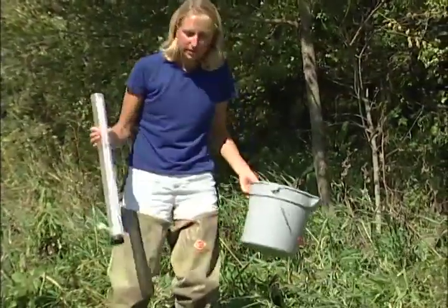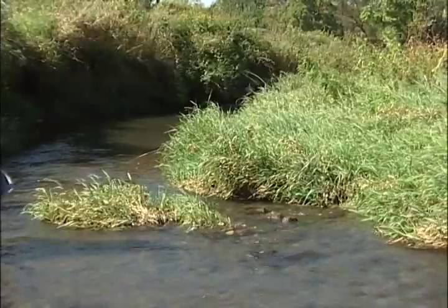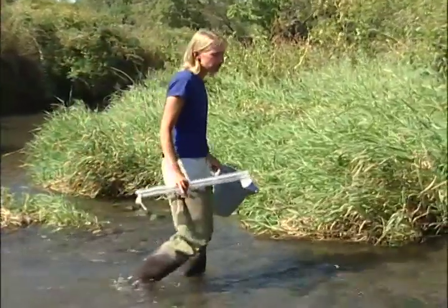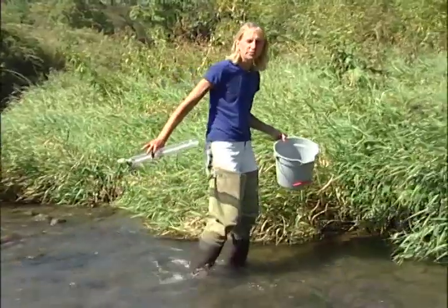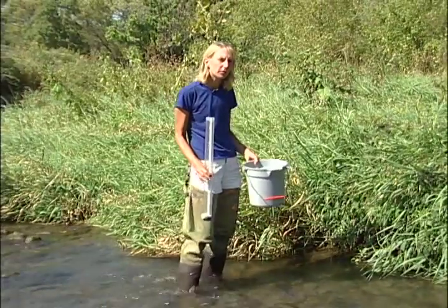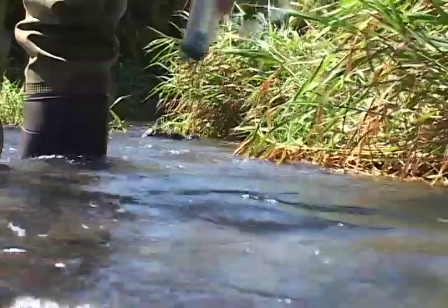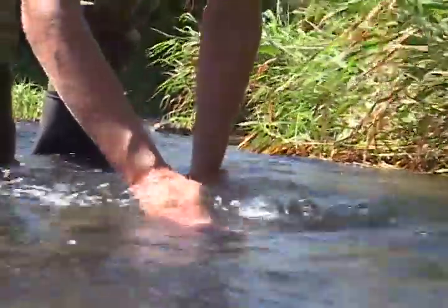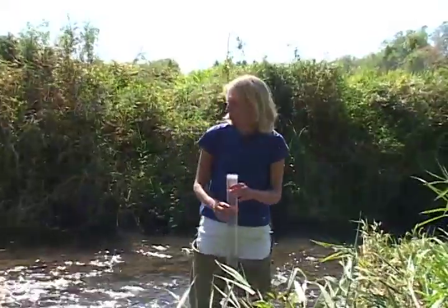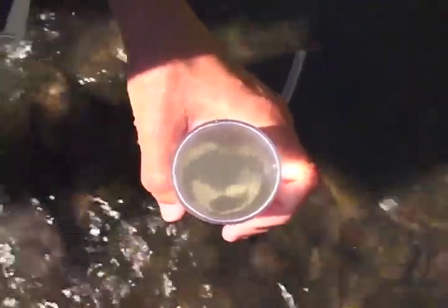When collecting your turbidity sample, make sure to approach your site from downstream so that you don't cause any excess turbidity in your monitoring site. The first method is to use the turbidity tube directly. Take the tube and plunge it into the water to let the entire tube fill up. Sometimes it helps to splash a little water into the top to get it fully filled. Then turn yourself away from the sun and look directly down through the water column to try to see the Secchi disc in the bottom of the tube.